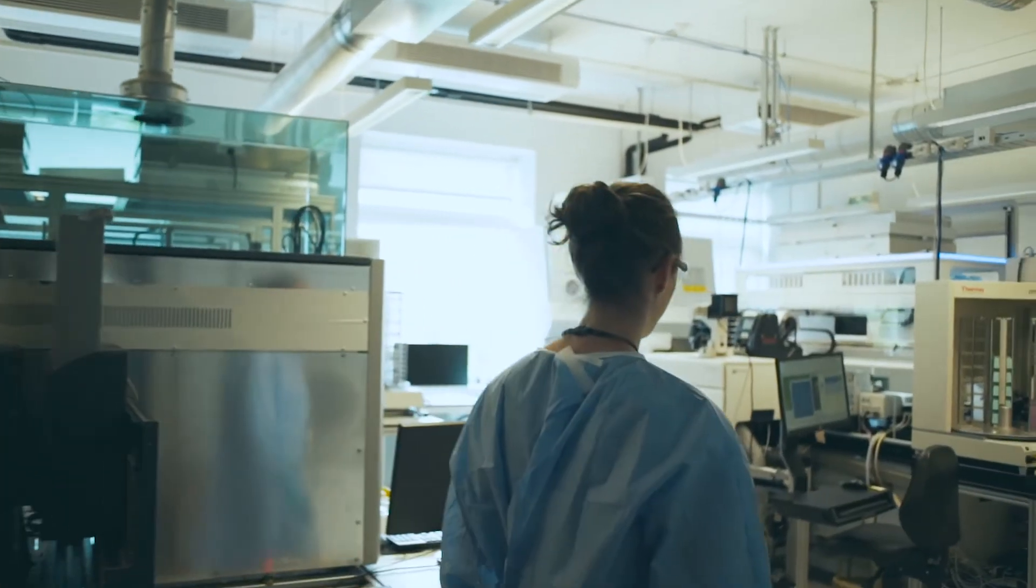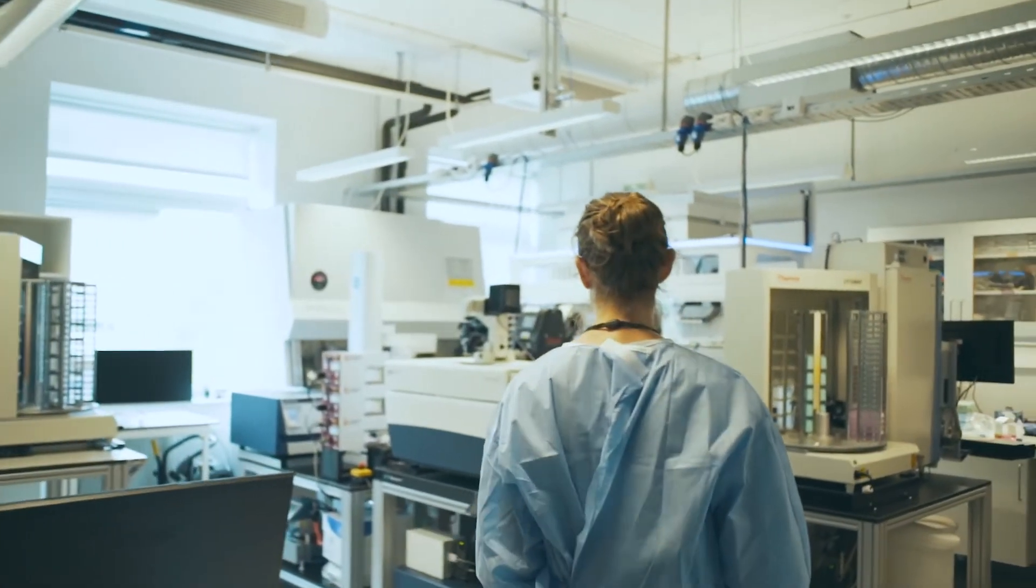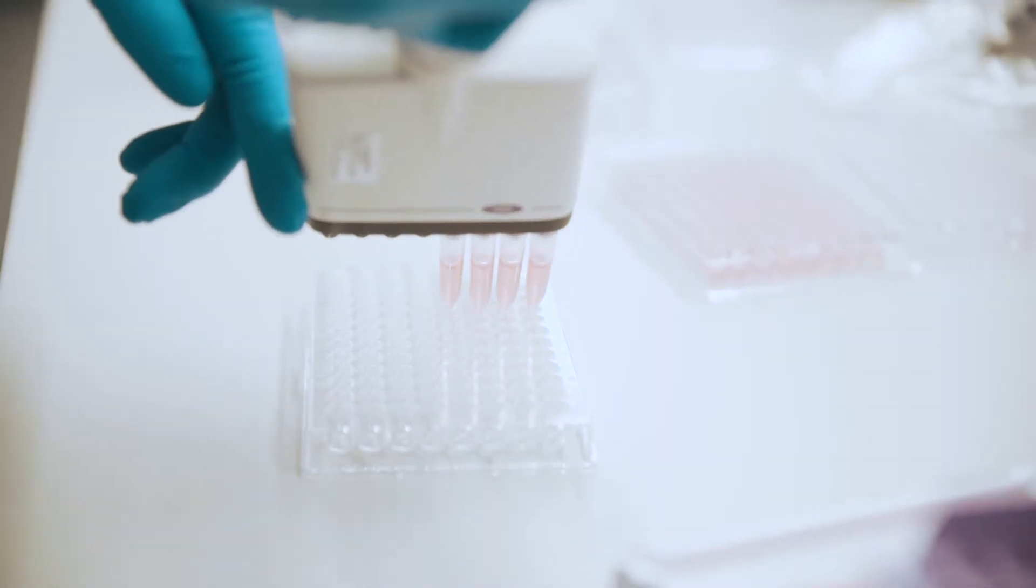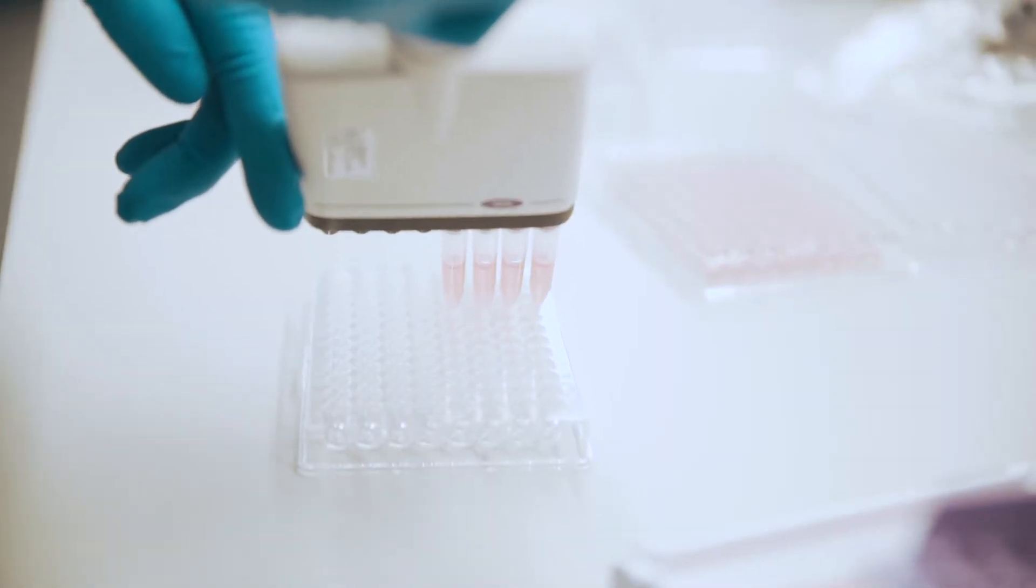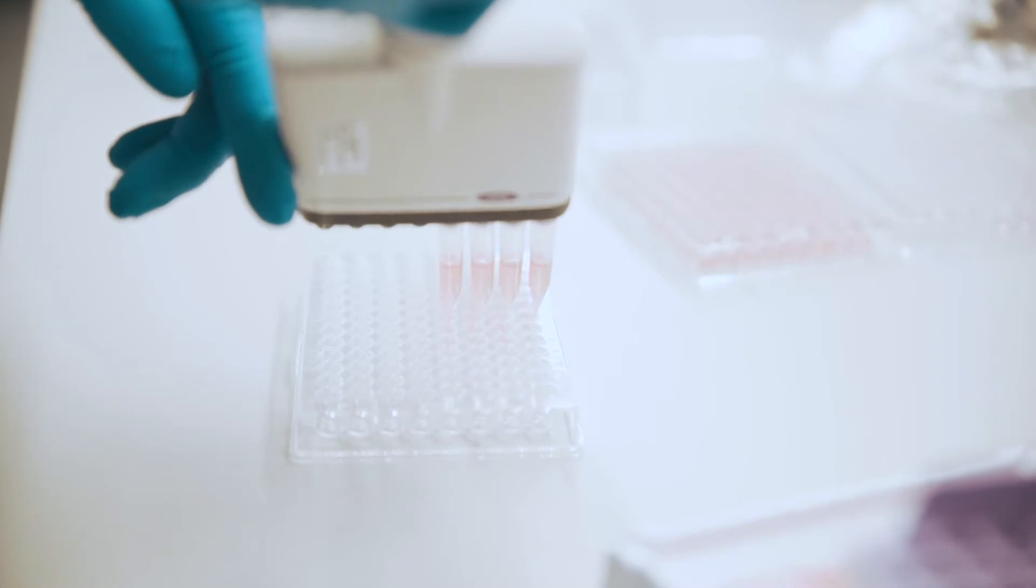Automating the cell culture process allows you to increase throughput, enabling you to successfully face increasing demand while reducing human introduced variability.